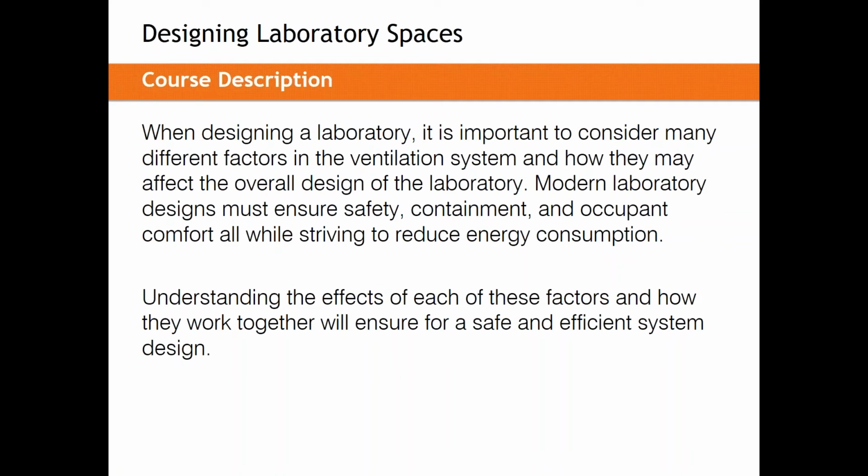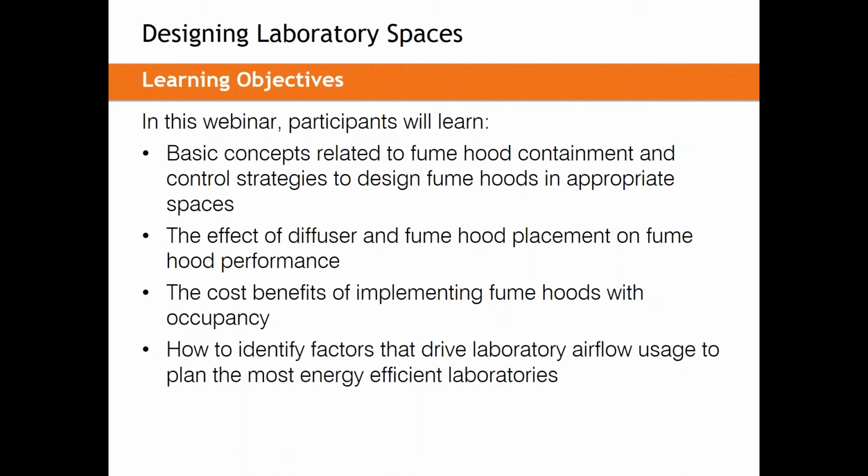So when designing a laboratory, it's important to consider the many different factors in the ventilation system and how they may affect the overall design of the lab. Modern lab design must ensure safety, containment, and occupant comfort, all while striving to reduce energy consumption. Understanding the effects of each of these factors and how they work together will ensure you have a safe and efficient system. So in today's webinar, you'll learn a few things.